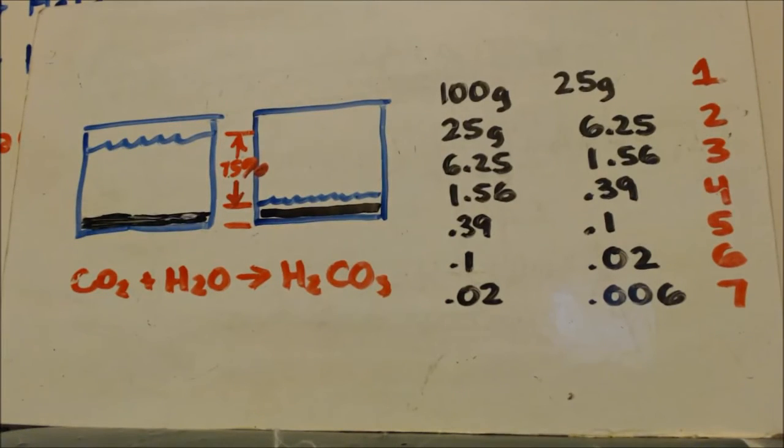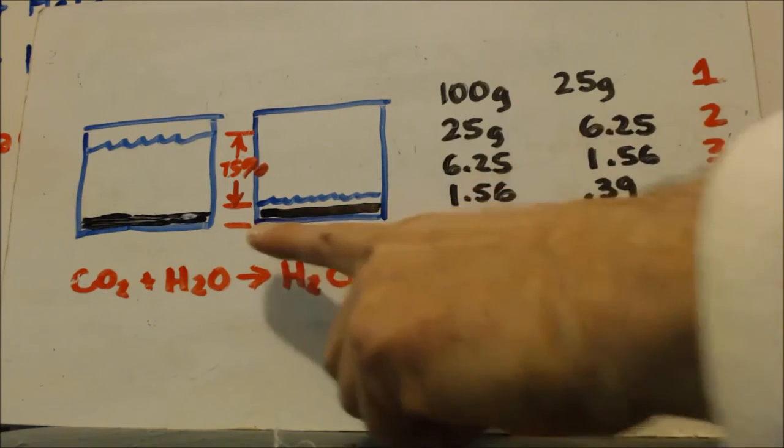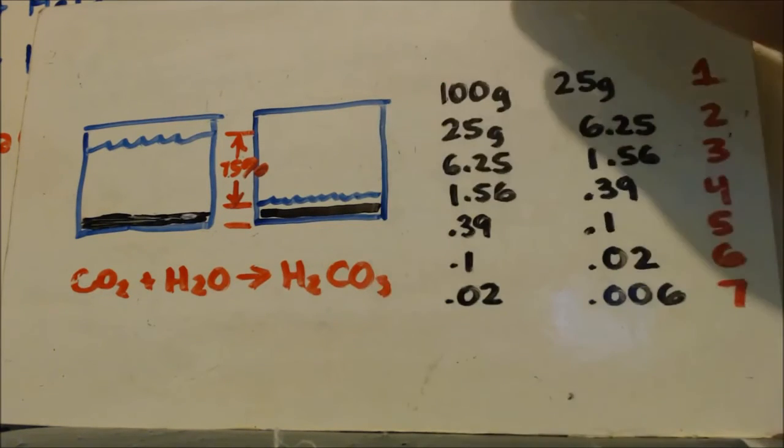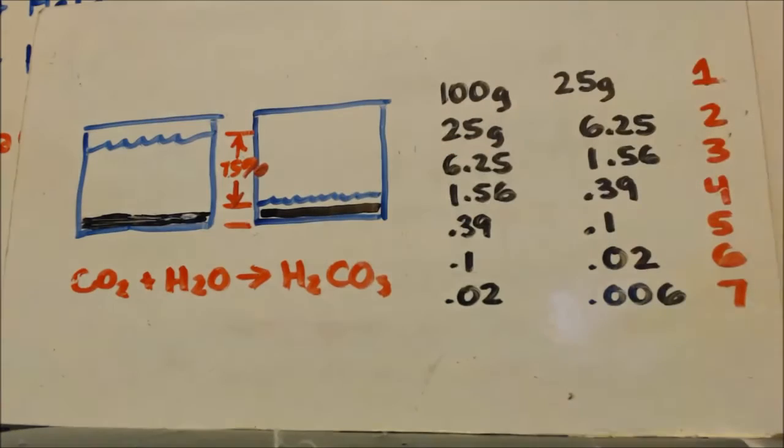That's nothing, man, because that's divided evenly among the 500 grams or 100 grams or whatever you got in there of your hydroxide. So I fill that up and I siphon it out. Fill it up, siphon it out. I do that like 5 or 6 times, or how many times I want.